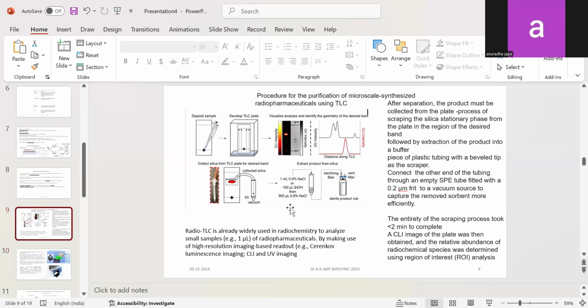Now, here is another technique which is used to detect very small quantities of analytes present. Of course, it is coupled with radioisotopes again. Not necessarily always should it be for radioisotope. Of course, it can be any visualization treatment, including radioisotope or a fluorescence material. How to handle the TLC plate can be seen in this diagram. So this is your TLC plate. It is run, it is dried, and it is put onto the visualization system to identify the location of the spot on the TLC plate. And then you are going to take it to a UV visible scanner or different types of scanning systems that we talked about till now, and such graphical representation can come.